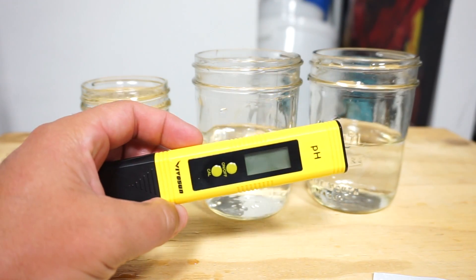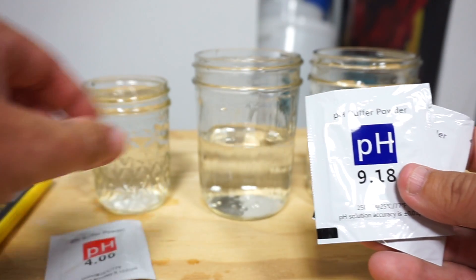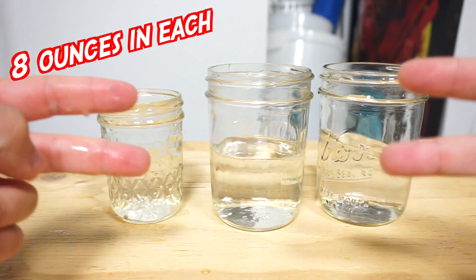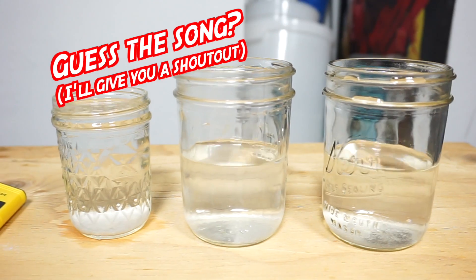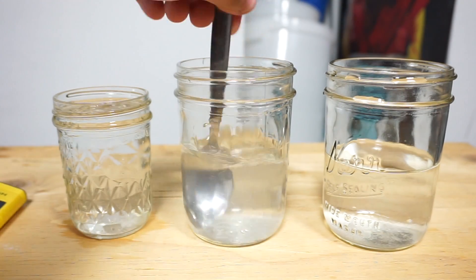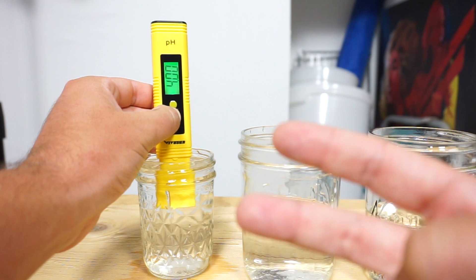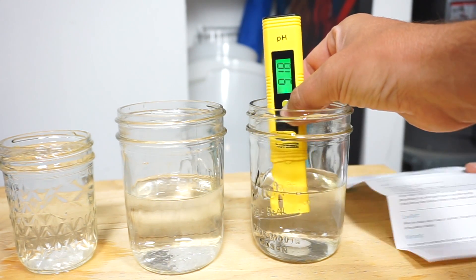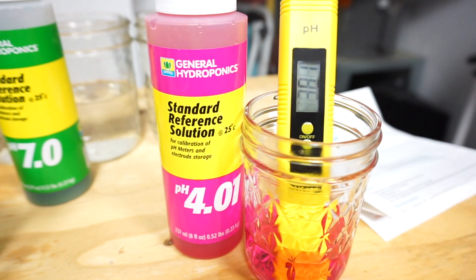The VivoSun comes with 3-tier calibration: 4.0, 6.86, and 9.18. Most pH readers are programmed to calibrate at 4 and 7, but sometimes you'll see 6.86, 9.18, or even 10. Here's how the directions read: get 3 glasses of water, each filled with 8 ounces, cut each packet, pour them into their own glass, and stir. This pH meter is easier to calibrate — just hold it down for 5 seconds in each cup. When it starts blinking, it has been calibrated. Every time you move from glass to glass, flick off existing liquid, swirl in tap water, then flick the tap water off. It looks calibrated and reads good at 7 pH, but at 4.01 we're already off to a bad start.